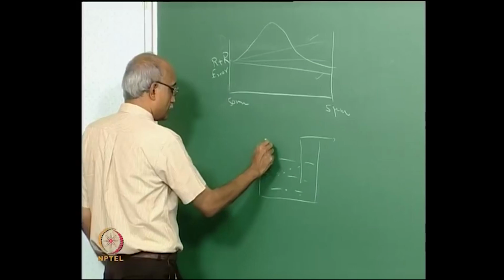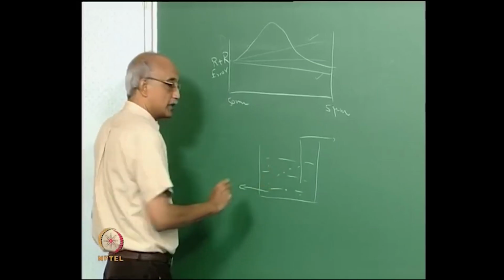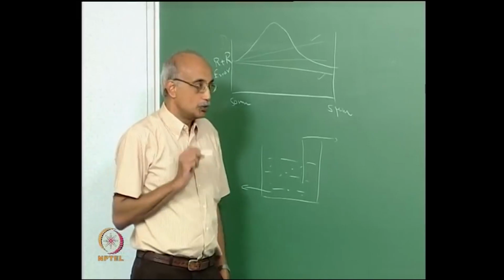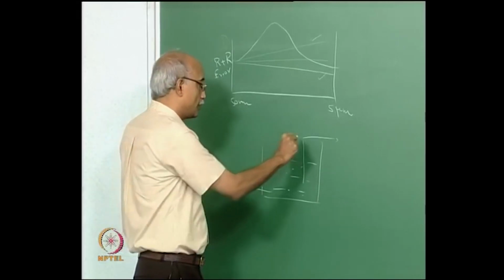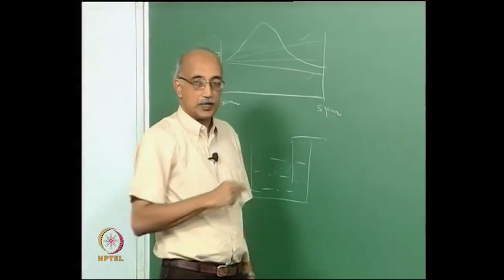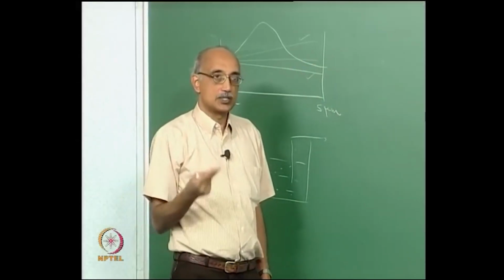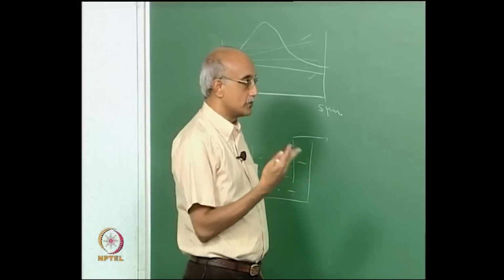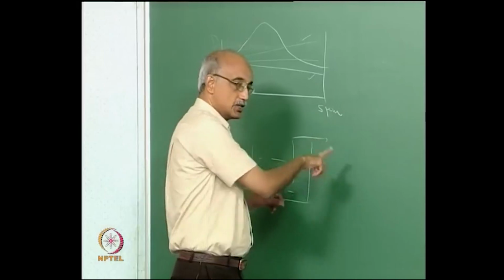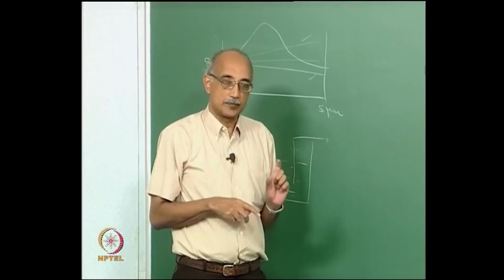The second set of readings may be taken from a different point in your fluid. Uniformity refers to how close these two values are in terms of all these other 7 parameters: precision, accuracy, resolution, sensitivity, repeatability, etc. How much of a variation do you see by position within the sample?